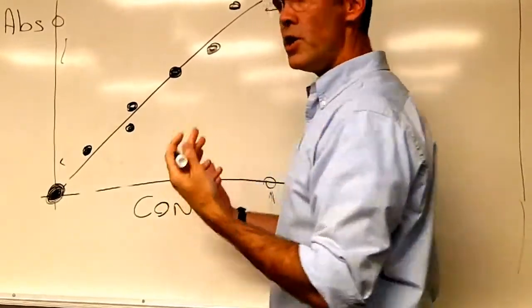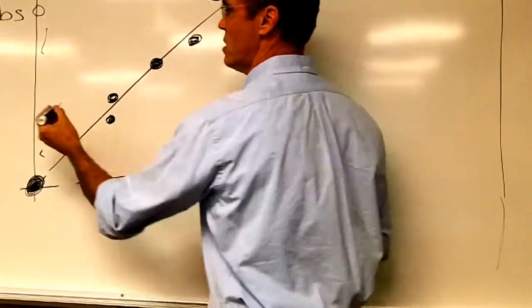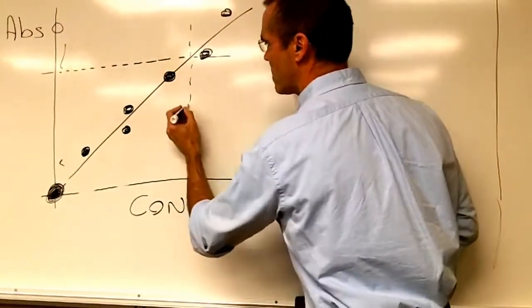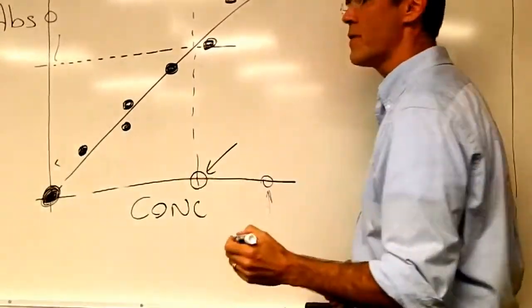For your unknown, you would measure the absorbance, and that's going to give you exactly the concentration according to this graph.